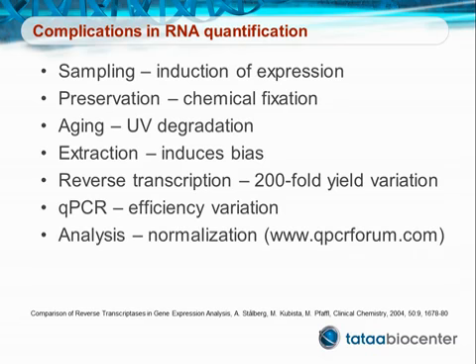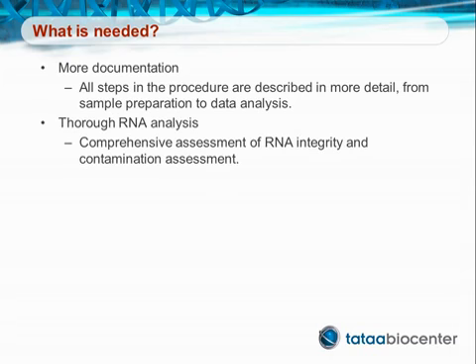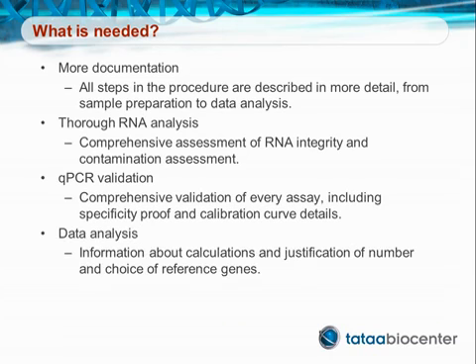When measuring expression, normalization is important for comparative analysis. As we have seen, several designs and normalization options are available. So what is needed to overcome the things that may have been overlooked before? First, we need to make sure that all steps in the procedure are described in more detail, that the nucleic acid targets are thoroughly analyzed, that the qPCR assays used have been properly validated, and that information is provided about how data analysis is performed and the choice of reference genes.